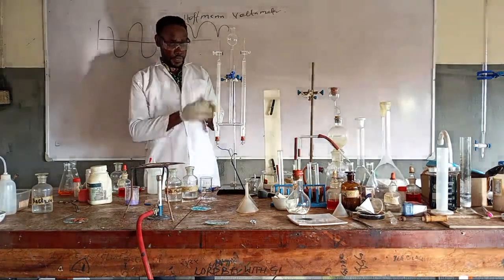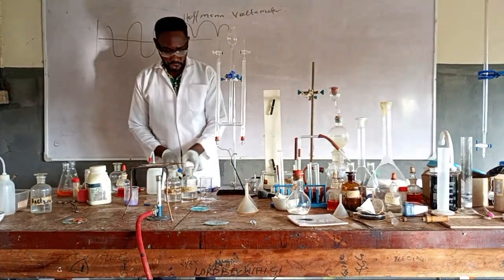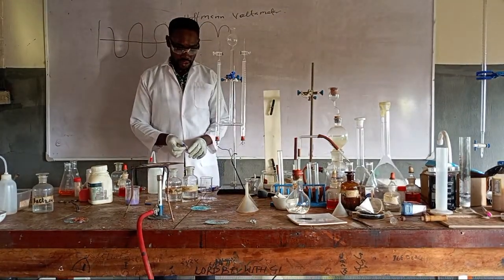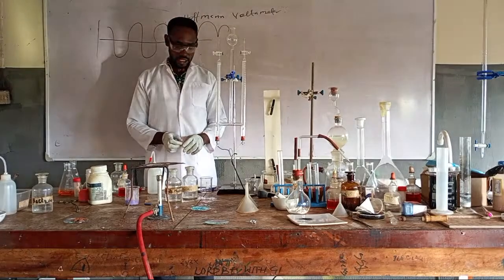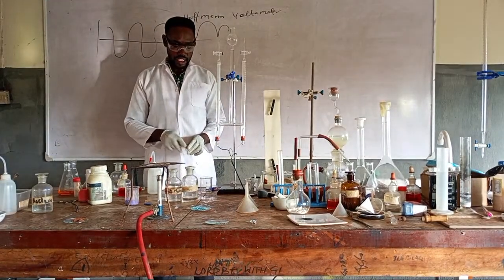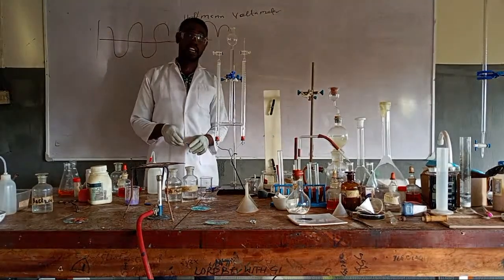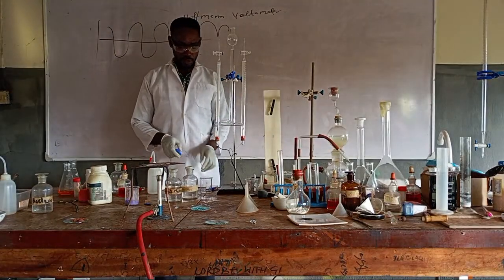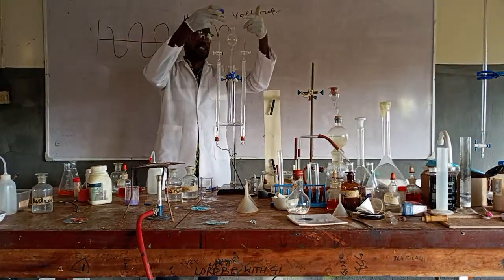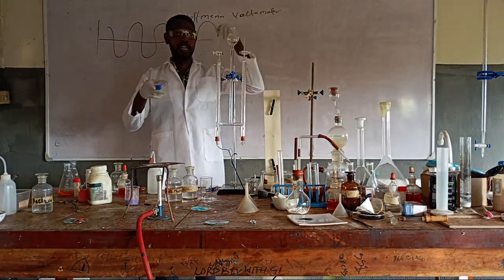So the process happening here, you call it what? Electrolysis. Meaning splitting. I've succeeded in splitting water into hydrogen and what? Oxygen. This was the experiment performed before scientists told you that water is made up of what? Hydrogen and oxygen. If I collect the two gases and spark them together, they will burn and still form back water.